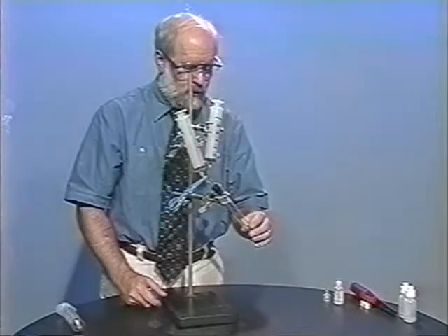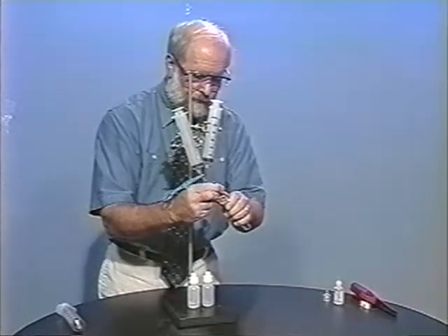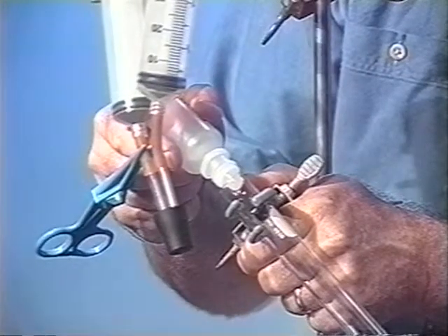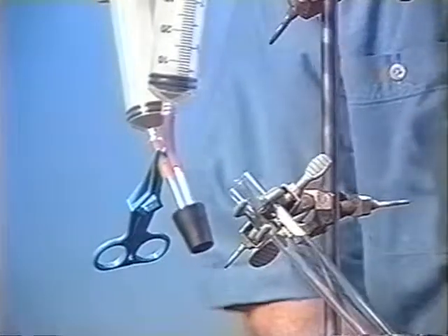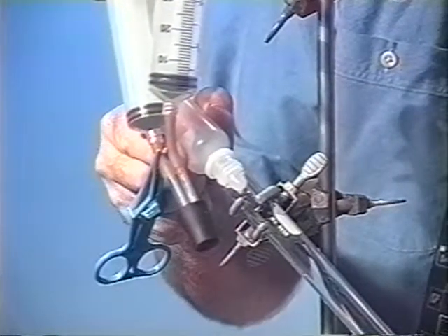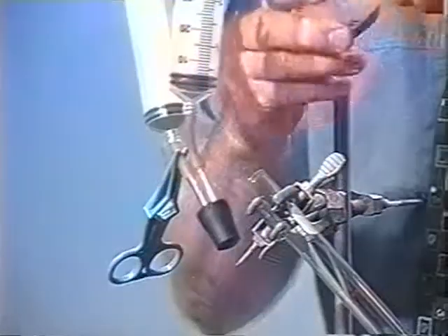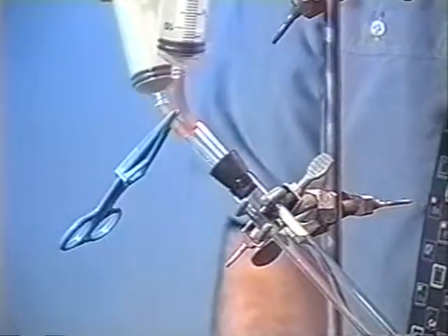The reaction I will do today will produce carbon monoxide, and it involves reacting formic acid and concentrated sulfuric acid. We need about eight to ten drops of each to perform the reaction. Sometimes the reaction just starts as soon as the sulfuric acid hits, but it's a very slow reaction and benefits from gentle heating.